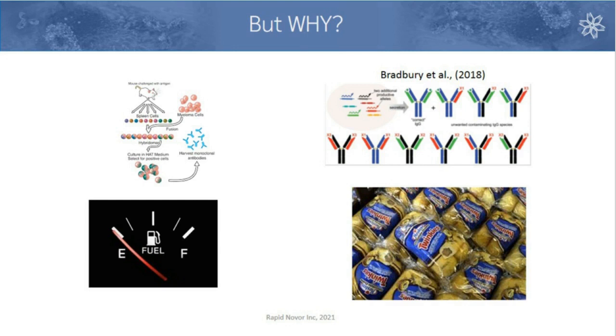Because it's not just about the cost of developing a new antibody or finding a new antibody, right? Some of you might actually have built an entire assay around an antibody of interest, and that could cost a lot of money for a lot of different reasons, right? In terms of validation, in terms of actually paying someone to develop that antibody-based assay. Anecdotally, I've heard teams spend hundreds of thousands of dollars developing an antibody-based assay for their application of interest, only to find that they've lost access to that antibody. You could develop another antibody for a lot less than that, but obviously developing the entire assay, again, around an entirely new antibody is another matter entirely, right?